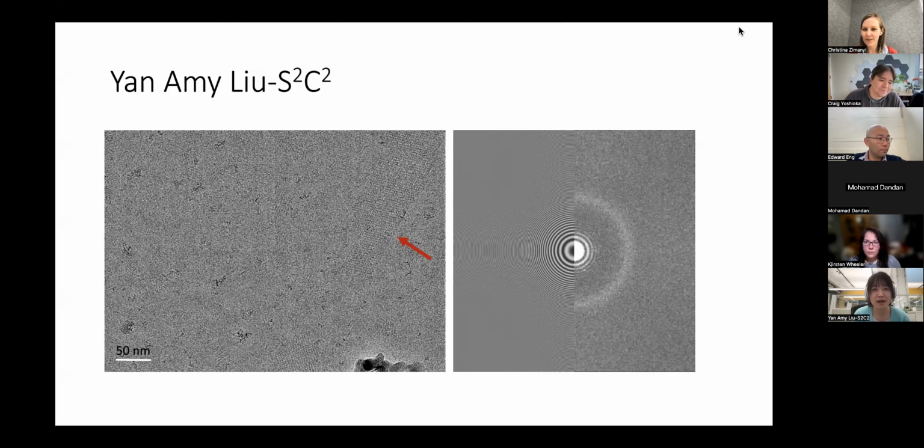This picture I found very interesting because I thought with a diluted sample, we shouldn't still see the crystals anymore. However, they are still there, and in my experience, 2D crystals are not good for single particle cryo-EM reconstruction. So I think for people who are used to crystallizing their proteins, if they see 2D crystals in the micrograph, they may consider changing buffers or doing some extra troubleshooting.